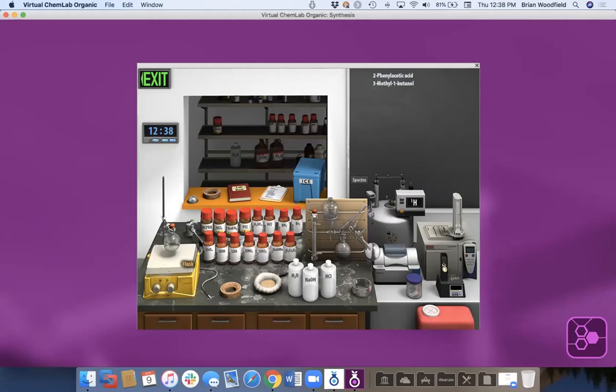I can add none of it. I can add one of them. So I want to do an esterification, so I'm going to add that. And so now I've added it, and you can see here, and I don't have to add it first. Now I can say, hey, maybe I want to add a condenser. But what if they start the reaction with just a condenser? Then it will just run at room temperature. So I can add heat. So the temperature runs based on the boiling point of the materials that I have in it. So by adding a certain solvent, I can adjust the reaction temperature and have this condenser.